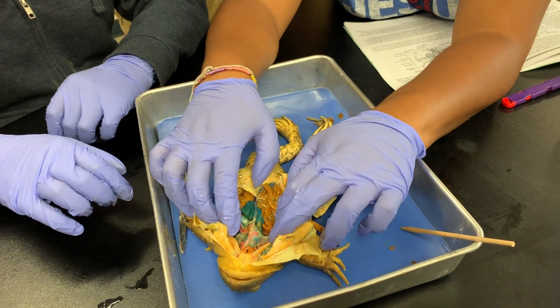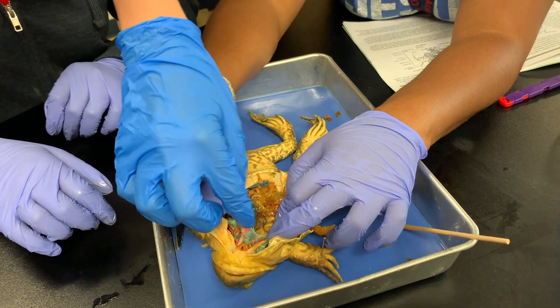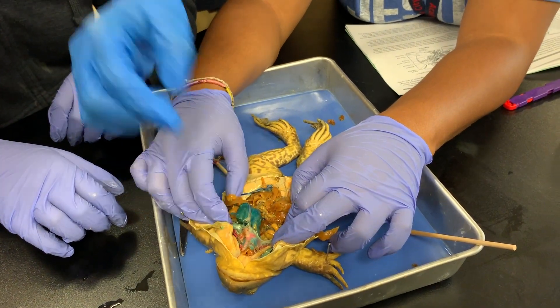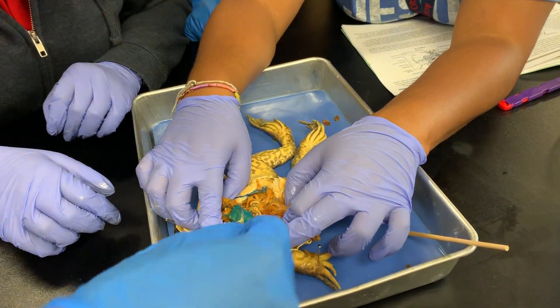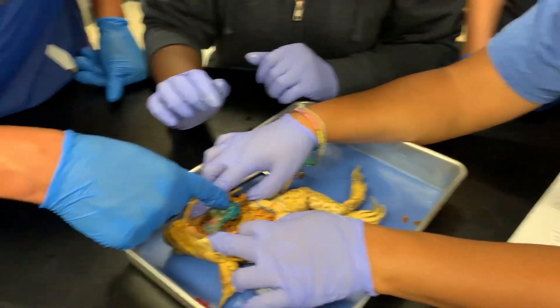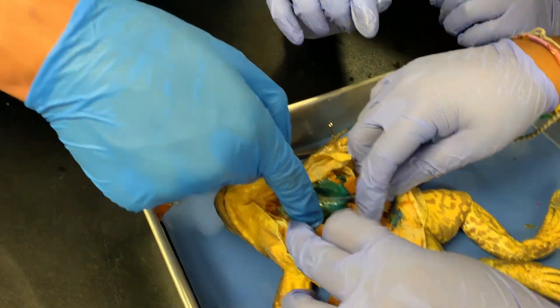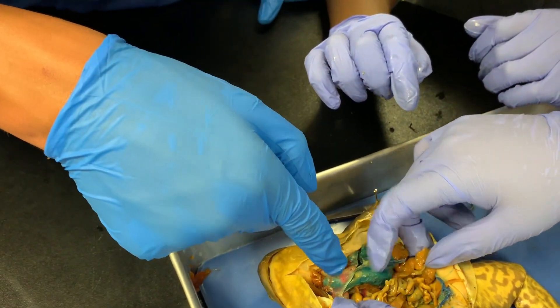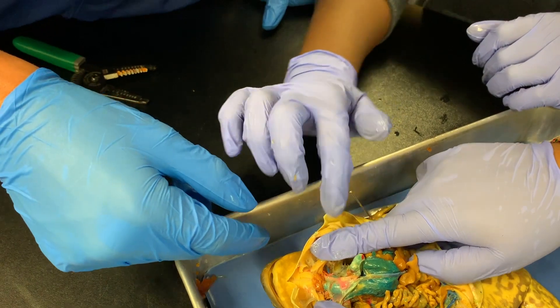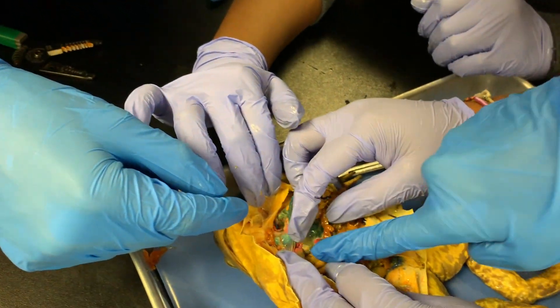What other organs do you recognize? Can you see the heart? Where is it — can you lift it up or touch it for me? Those are lungs. Are these the intestines down here? We have intestines. Where's the heart — is it under the lungs? Lift up your lungs. Do you see the heart right there? We're getting there.